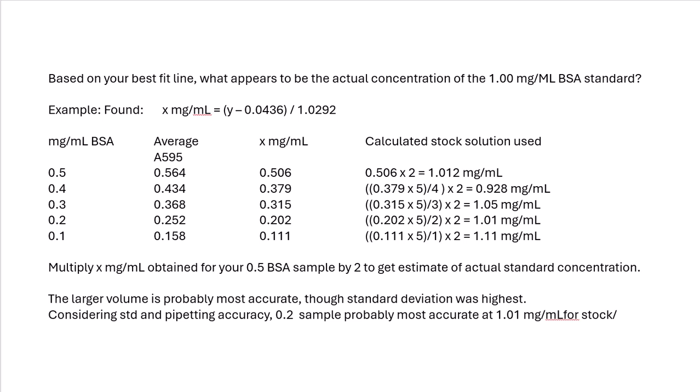It makes the calculations simpler. And also, though, if you were to do this yourself, then you would take that concentration, read it at least in triplicate, and then you would use that value. So how bad is it? How much off is the calculated stock solution? I mean, I said it was 1.00. How accurate was that? We tried our best to make it 1.00. So what do we see in reality?